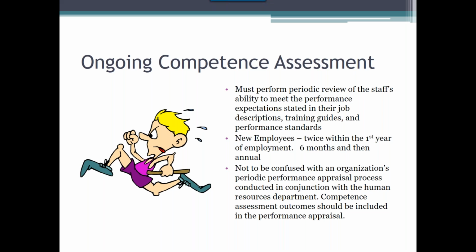and then annually thereafter. It is important to note here that ongoing competency should not be confused with the performance evaluation that is conducted for the organization generally on an annual basis. While ongoing competency or lack thereof should be reflected in the performance evaluation, the performance evaluation is not a replacement of formal competency assessment.